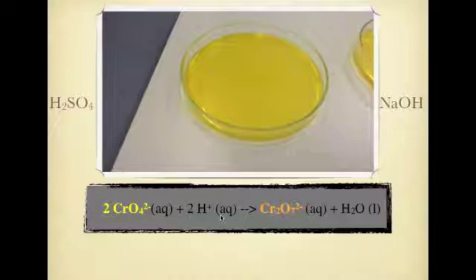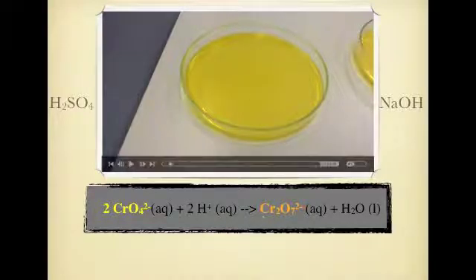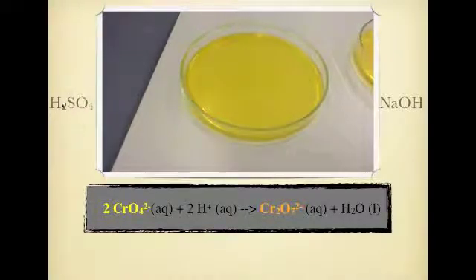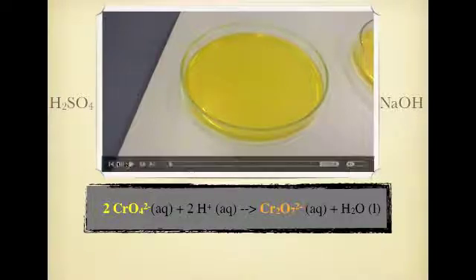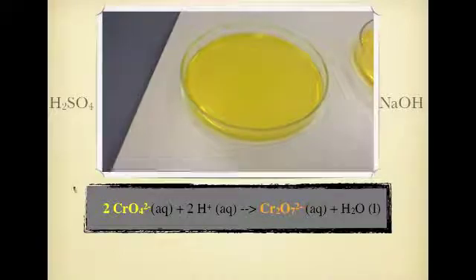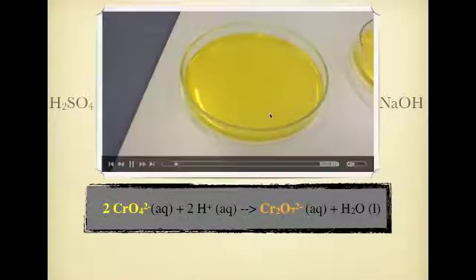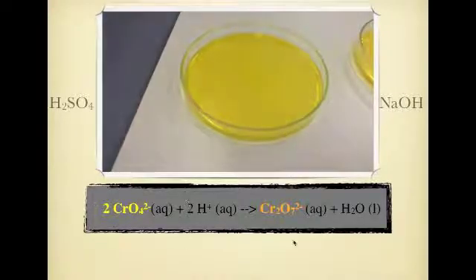We're going to do two things to this solution. We're going to first of all add some sulfuric acid, and then we're going to add some sodium hydroxide, and we're going to see what happens to this as we add them in, and then we're going to explain why.